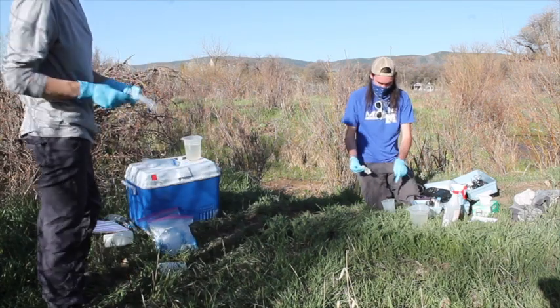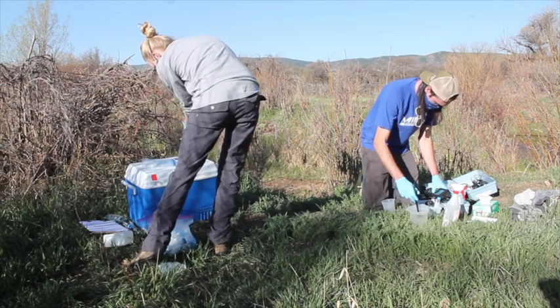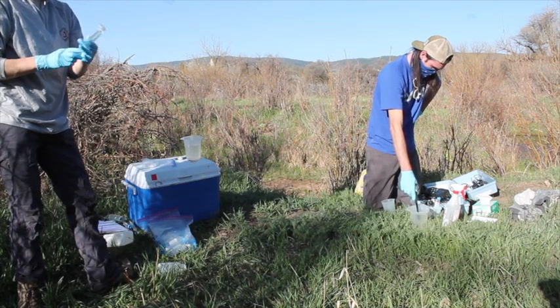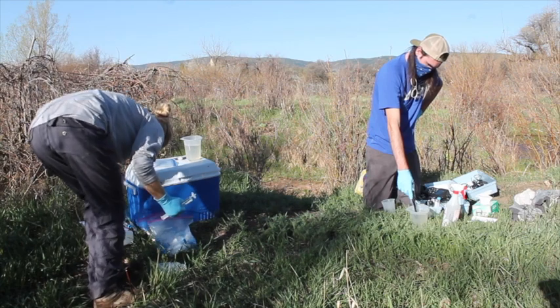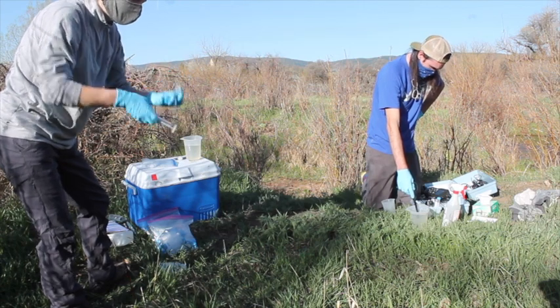The water here is pretty turbid, so I've already pretty much spent this filter — it was getting hard to push water through. I'm going to switch to a new filter, flush it out first, and then take my dissolved metal sample and fill that up.